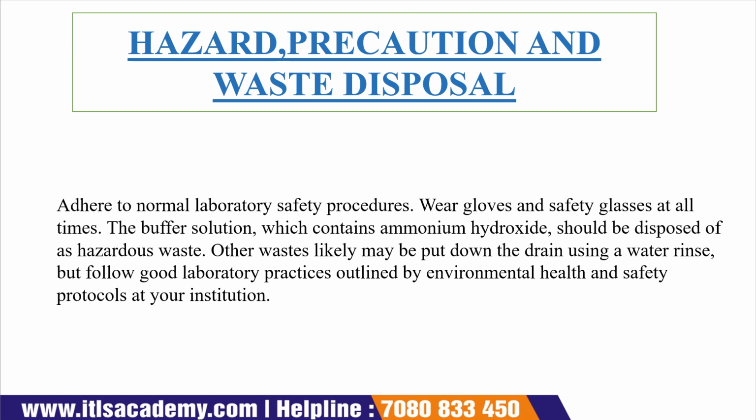Now see what is written in the slide. Adhere to normal laboratory safety procedure. Wear gloves and safety glasses at all times. The buffer solution which contains ammonium hydroxide should be disposed of as hazardous waste. Other waste may likely be put down the drain using a water rinse, but follow good laboratory practices outlined by your environmental health and safety protocol at your institution.